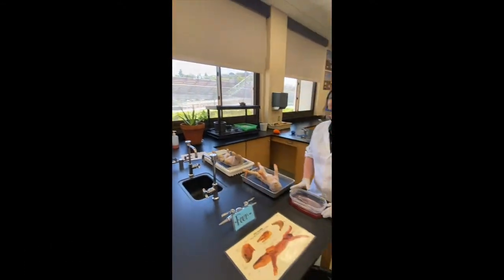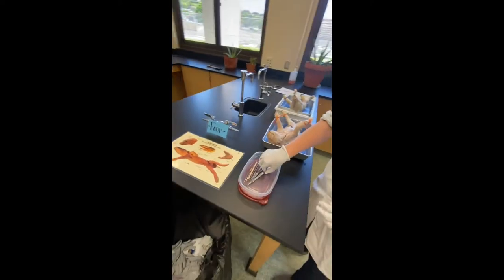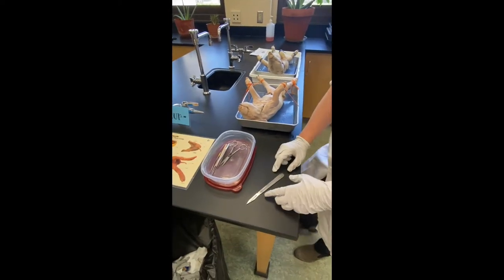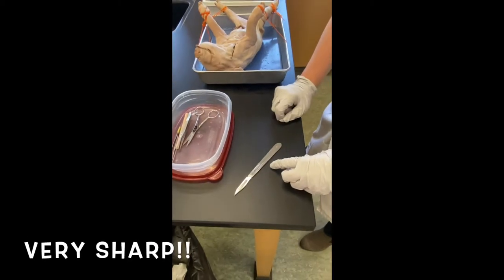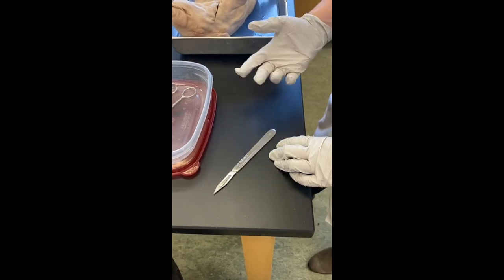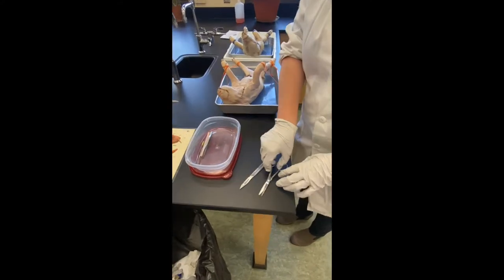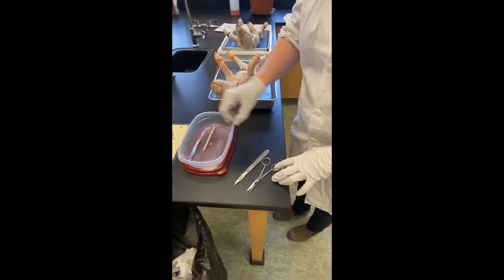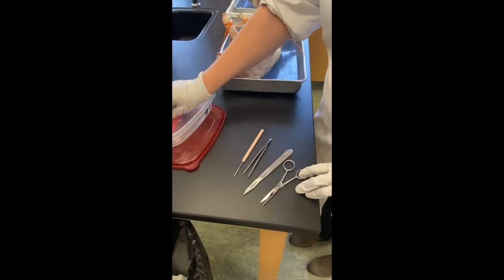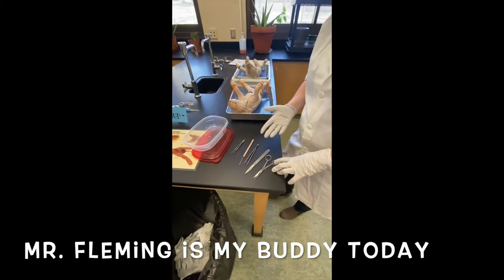Here are our two pigs, and I want to go over the tools that we're going to be using, because that's important. Most important is the scalpel, a medical grade scalpel, and it works very well. I like to use that because then you don't injure yourself using a tool that's not sharp. It actually does the job it's designed to do. We have some sharp scissors, a long pair of tweezers, the pointer that we will use to point out organs, and just a small pair that sometimes, when you're working with partners, helps to have a buddy help you out. So here we are with our tools.